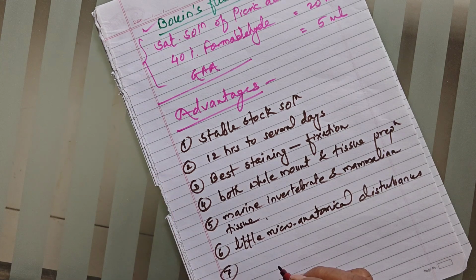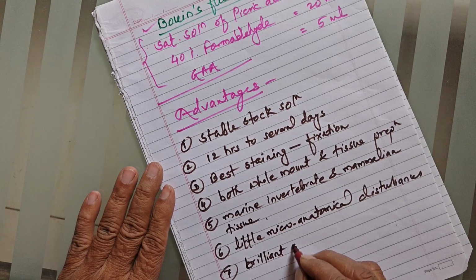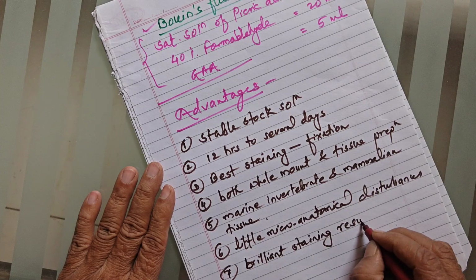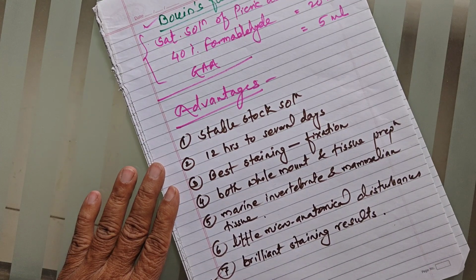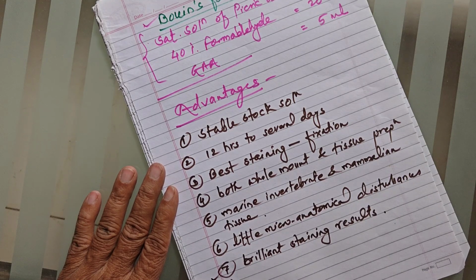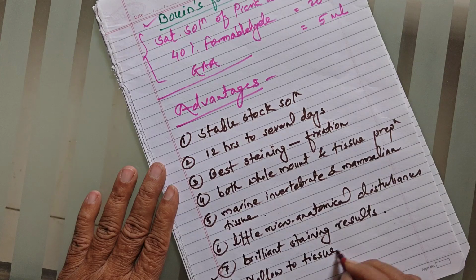Another advantage is Bouin's fluid permits brilliant staining results, that is, excellent staining results are achieved. And the last one, it gives a yellow color to the tissue, which is useful for handling the tissue.